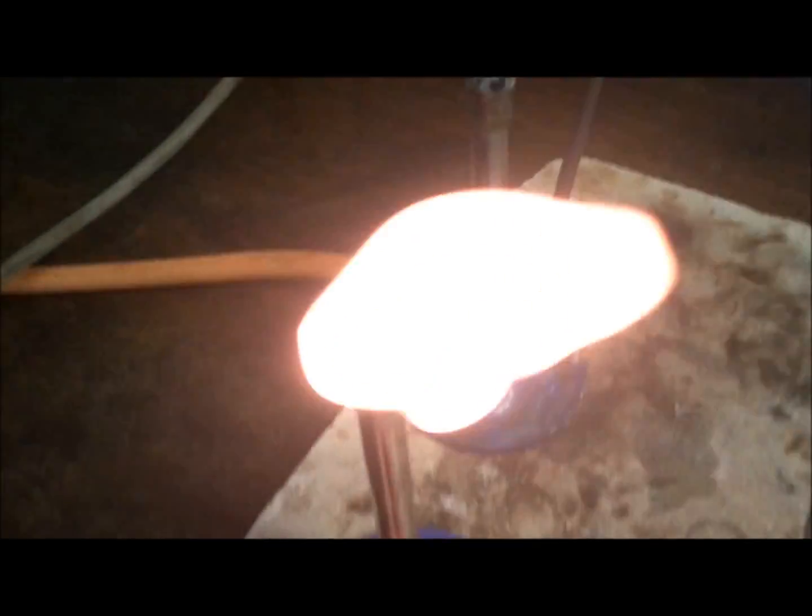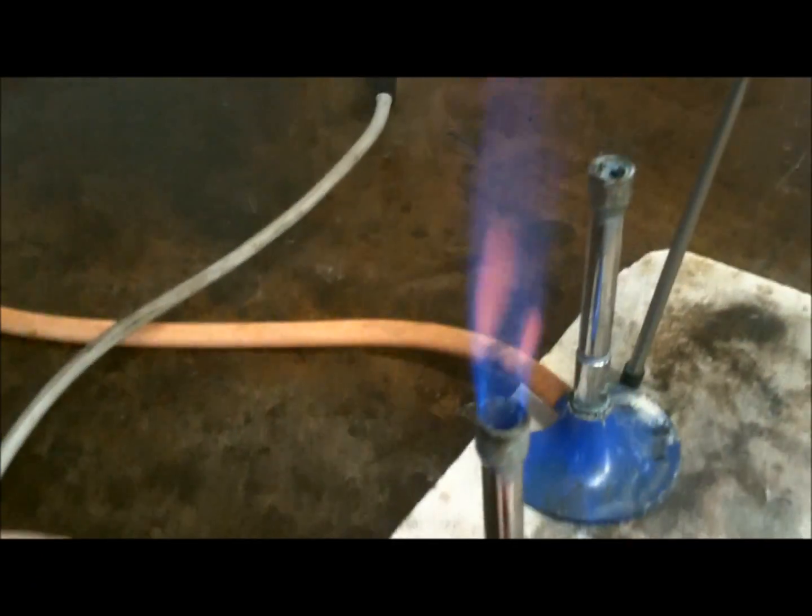That looks better already. That's better. Pull it back slightly. Get it at the top of the blue cone — that's the hottest part. We're incinerating some limestone. When we get it at the top of the blue cone, it goes — calcium carbonate — it goes fiery. That's not the top though. I'll show you, Sam.